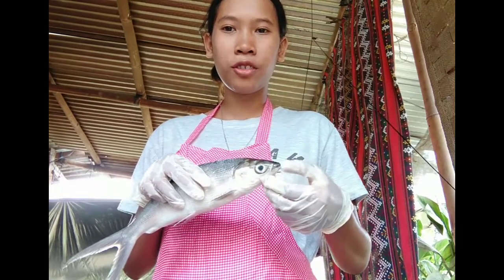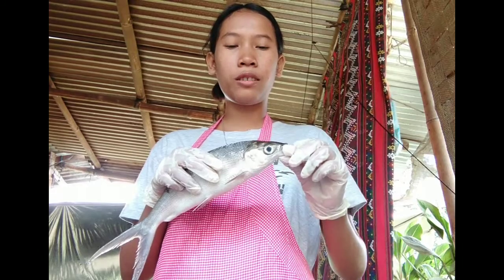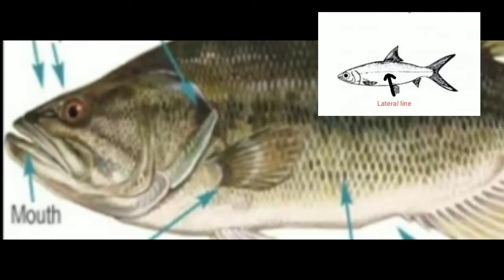The nares or nostrils are used to detect odors in the water. This is the mouth of the fish, and it is used to eat. Also, the fish mouth's shape is a good clue to what fish eat — the larger it is, the bigger the prey it can consume.